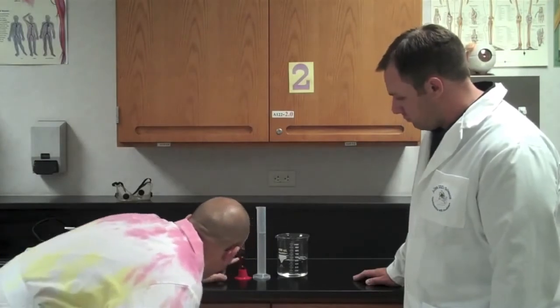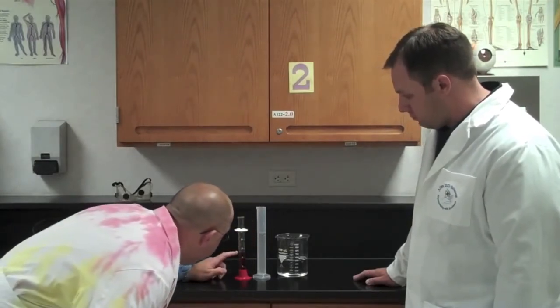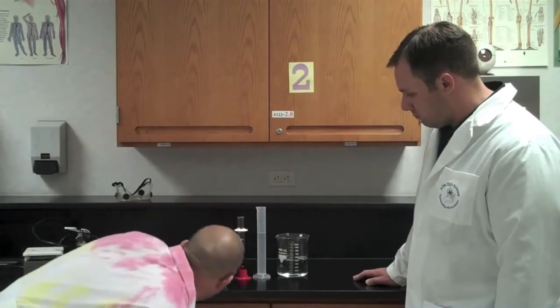So when I read that, it tells me the bottom here is 20. The next big line is 30. The halfway is 5, so it's 25. I'm going to go up and it's really 26 milliliters. Lowercase m, capital L, milliliters. Real simple.